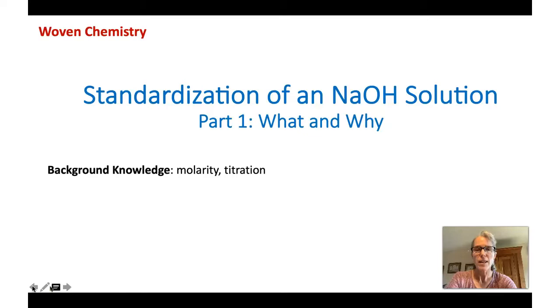And then part 3 takes your thinking up another notch to that AP or college level, where I'm going to propose a number of errors and mistakes that may have happened during that procedure, and then ask you what impact they might have on your calculated results. Okay, so with that said, let's get started on what a titration is.